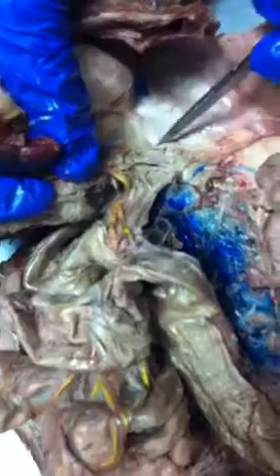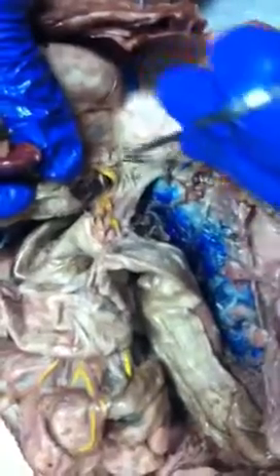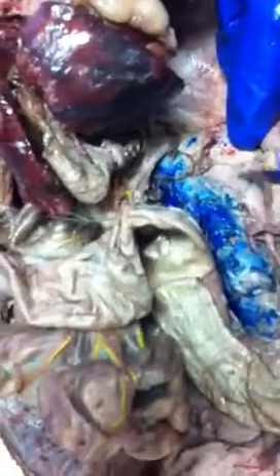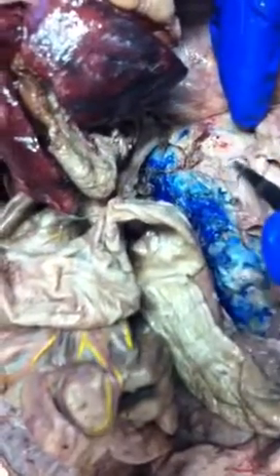Right, underneath that fat is where your dorsal aorta is. See this branch number 1? Can you see that branch number 2? Branch number 1 is celiac trunk. Branch number 2, superior mesenteric artery. Branch number 3 is going to go to your kidney, and that's going to be renal, and your renal is right there. See that right there? That's your renal artery.